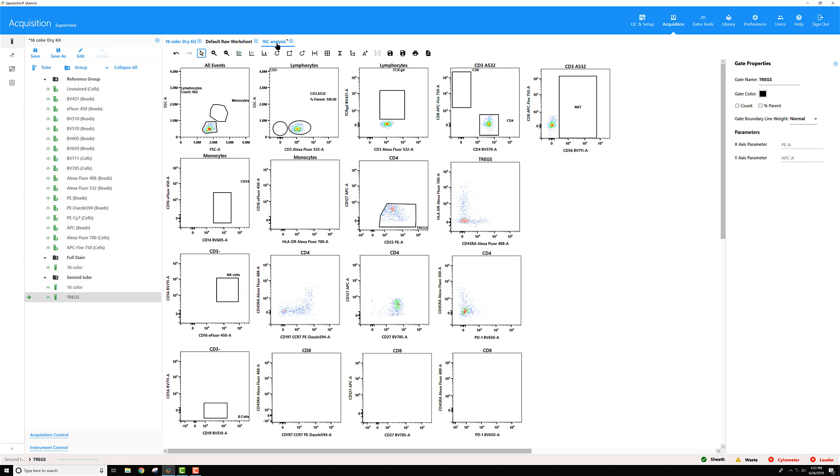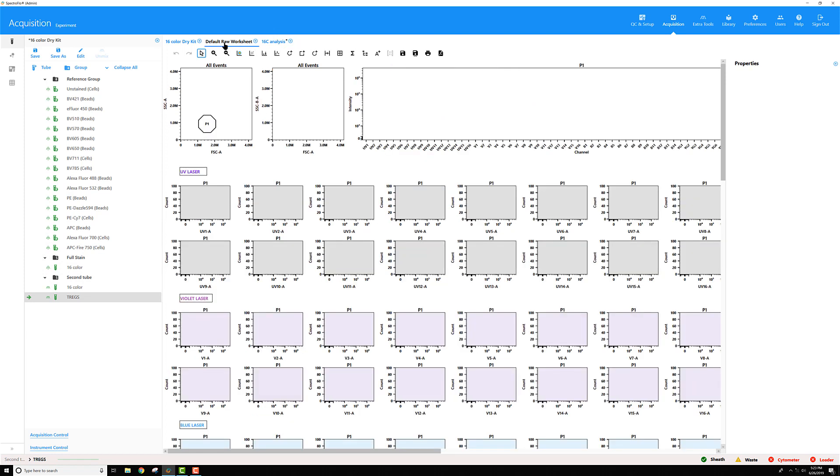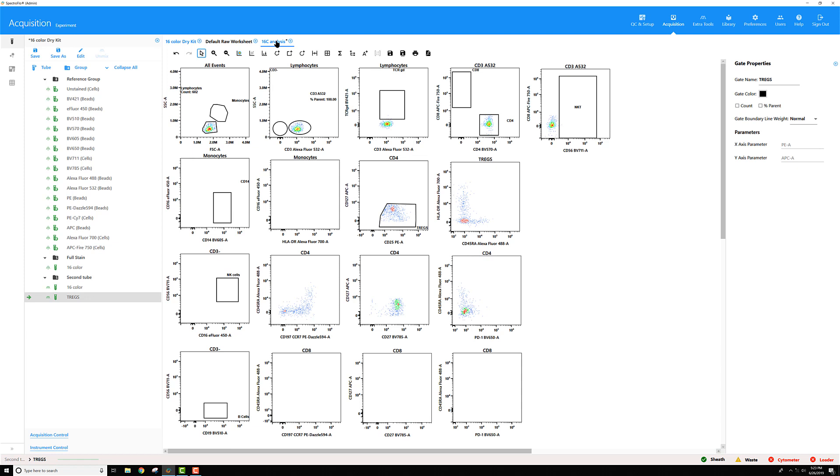Also, since I exported from the unmixed worksheet, there's no raw data in this file, so when I toggle to this raw worksheet, nothing is displayed because the only data that's there is unmixed data.